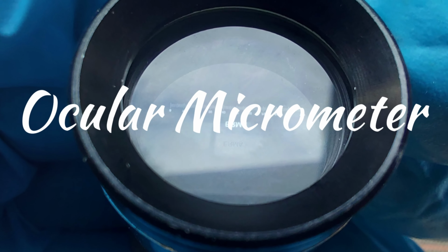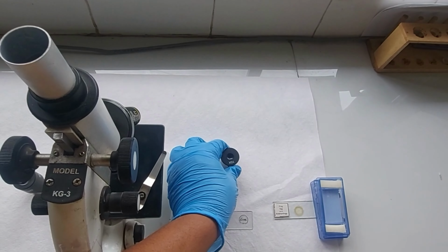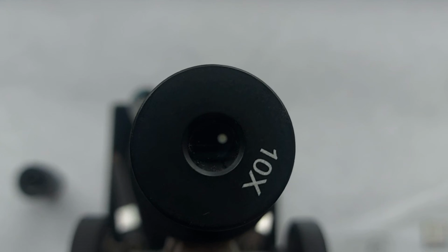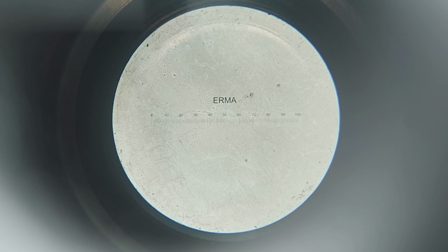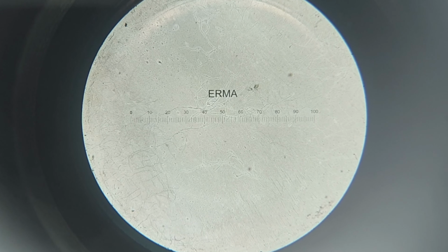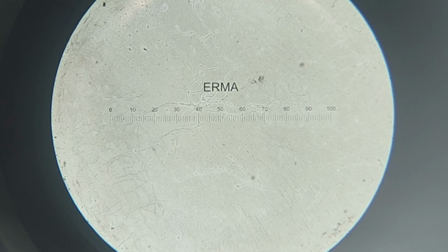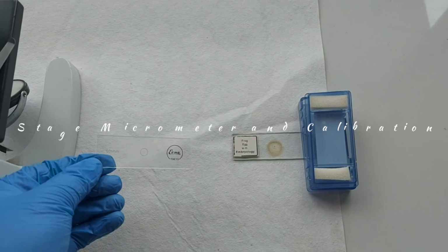The ocular micrometer is a small glass disc carrying an engraved scale. It is inserted inside the eyepiece of the microscope. The divisions on the ocular micrometer do not possess any fixed value. Therefore, calibration is essential before taking any measurements. The scale can be observed through the microscope. Since this scale is arbitrary, its value must be determined by calibration using a stage micrometer.